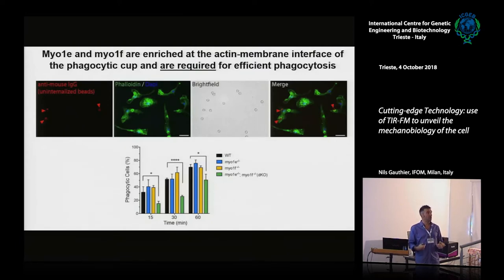meaning that they have been engulfed by the cell, because you also have the image of the cell, and you can know this cell has engulfed 2 beads, and 1 bead is in, and 2 beads, for example, here you have fluorescence, 2 beads are out. Then here, for example, you have this cell that has 3 beads, 2 beads are out on the left, and 1 bead is completely engulfed because it's not accessible to the antibody.